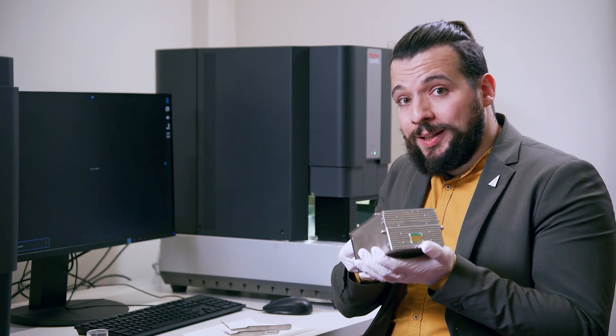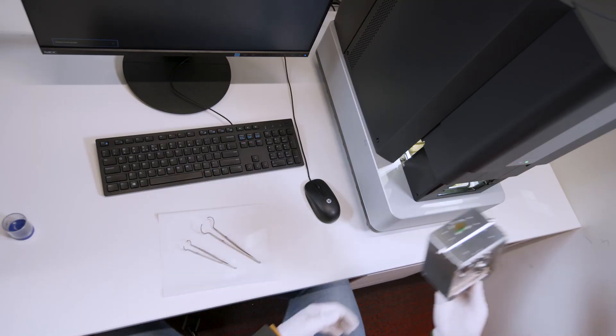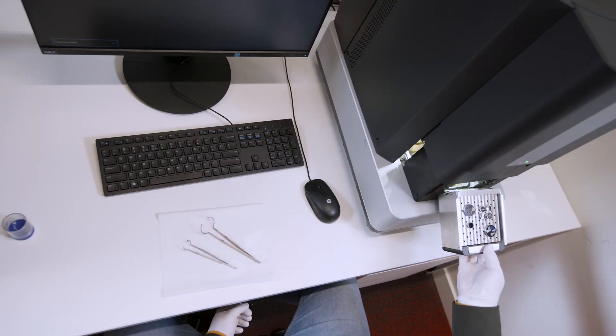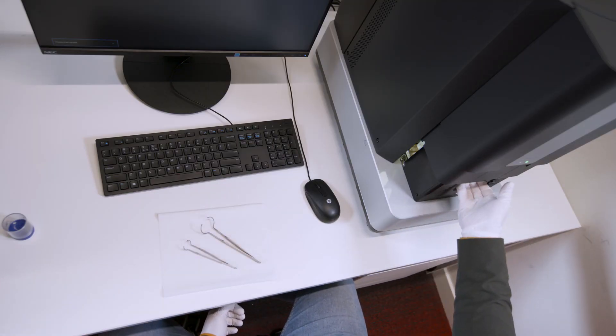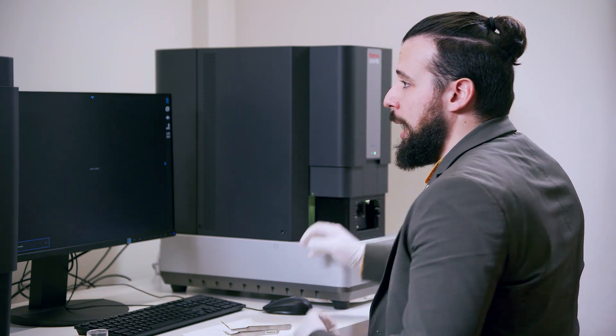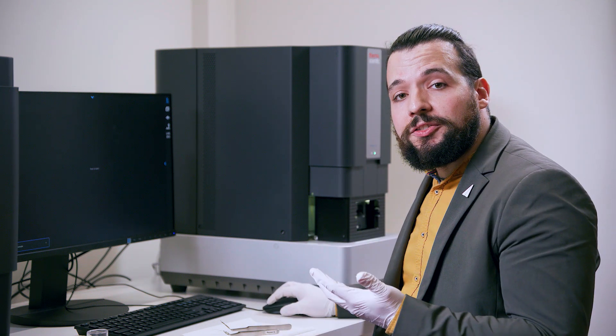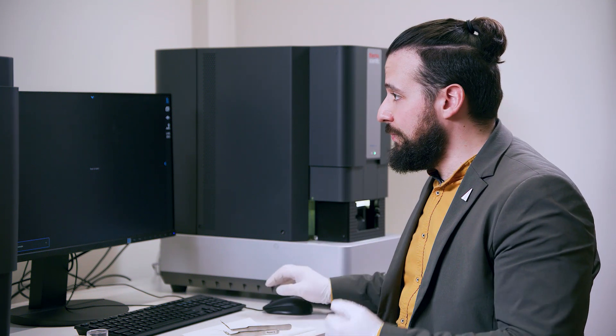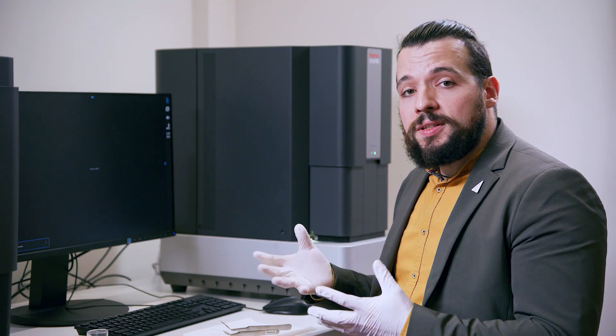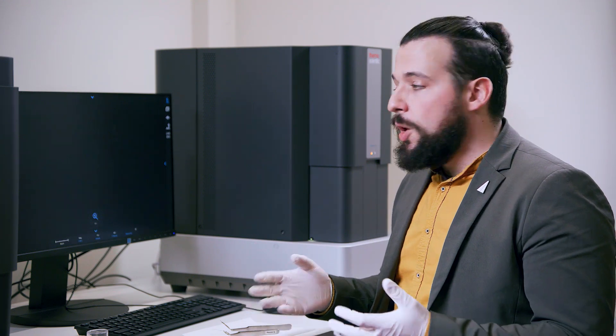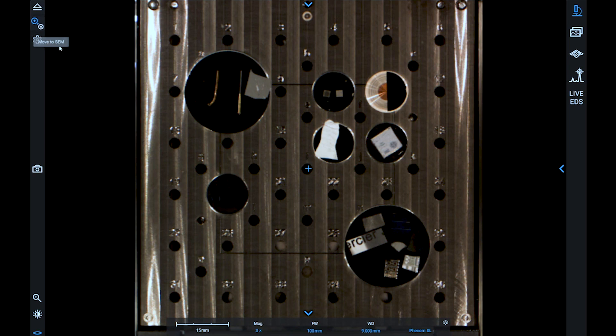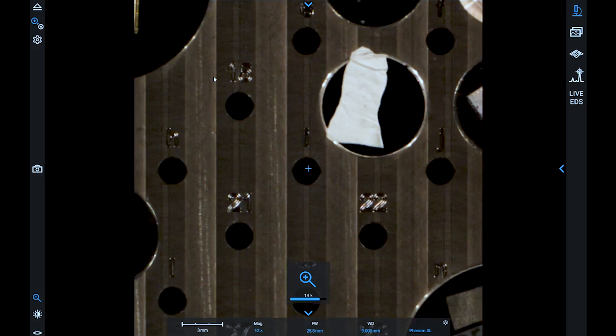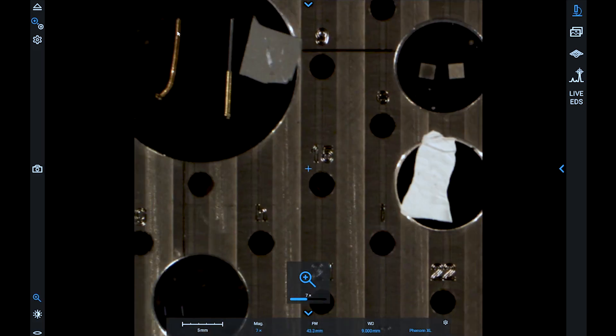We are now ready to load the sample holder and we can close the door from the user interface. As the door closes, the loading procedure starts, and the first thing that we will see is an optical image of our sample with the integrated navigation camera. We can use this image to select the sample that we want to image and we can start zooming in so that we can get a clearer view of the sample itself.